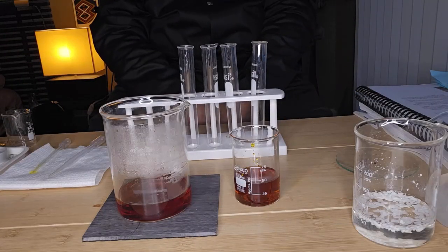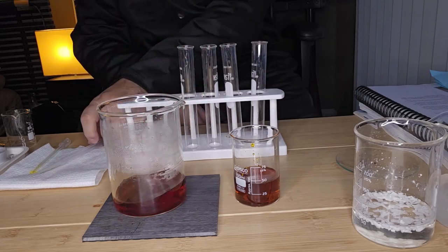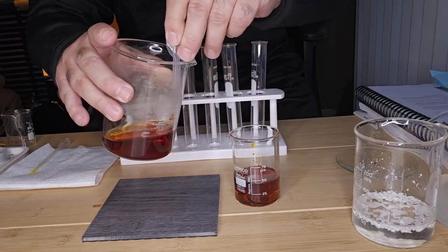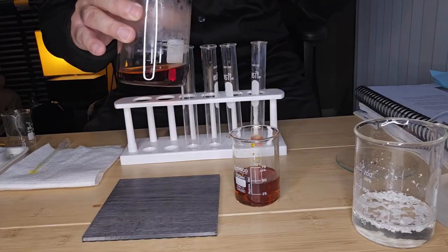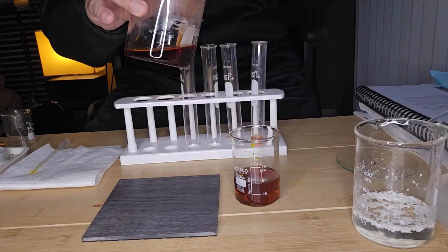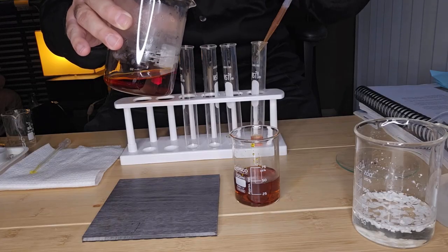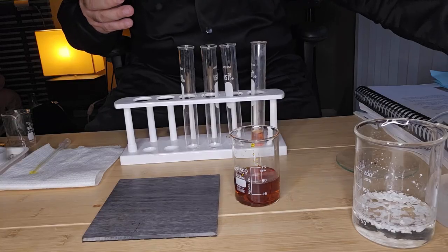Okay, so the sol has cooled down now. I'm going to pipette about 5 mLs of this sol into a test tube, like so. I'm going to put that aside.